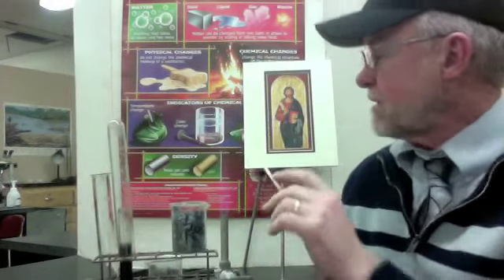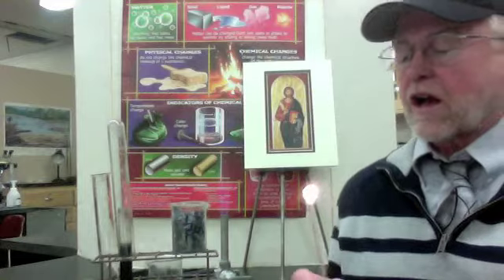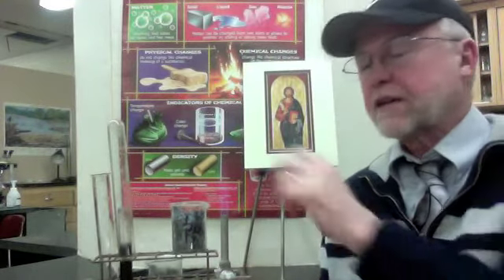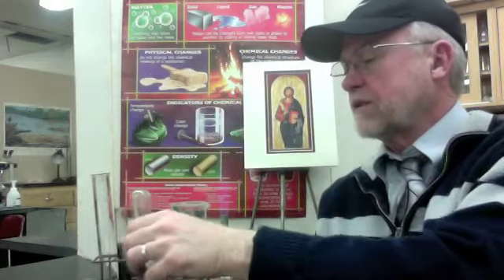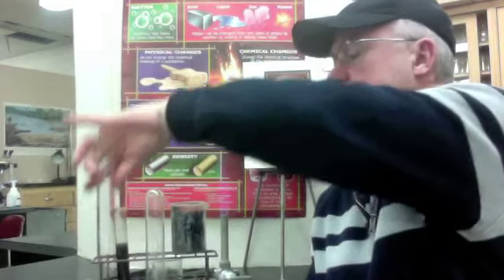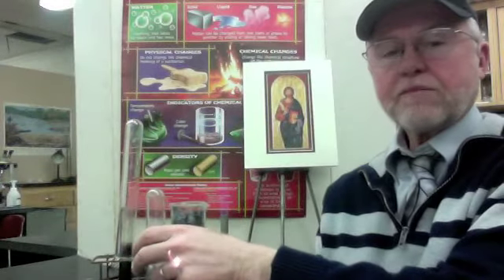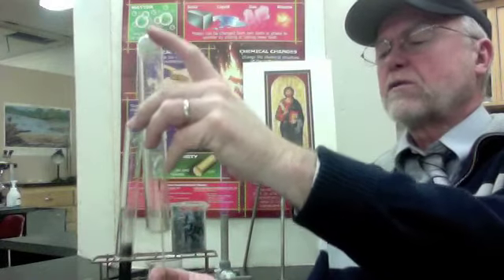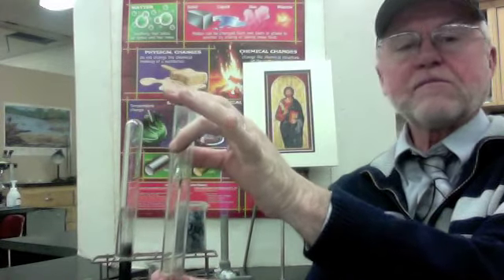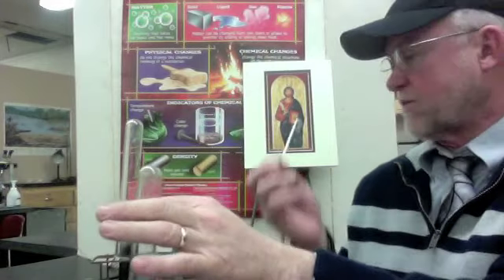Let me test this gas here. Okay, first I'll test for oxygen. You know what I'm going to do, I'm going to get a second test tube just in case I want to run this test twice. I'll put that one right there, and I'm going to turn this one upside down over here like that. Okay, got it. Now first I'm going to test for oxygen, which is of course a glowing splint. I put the glowing splint in there, and I don't know if you saw it, but it just went out. It didn't reignite. Means oxygen's not present.